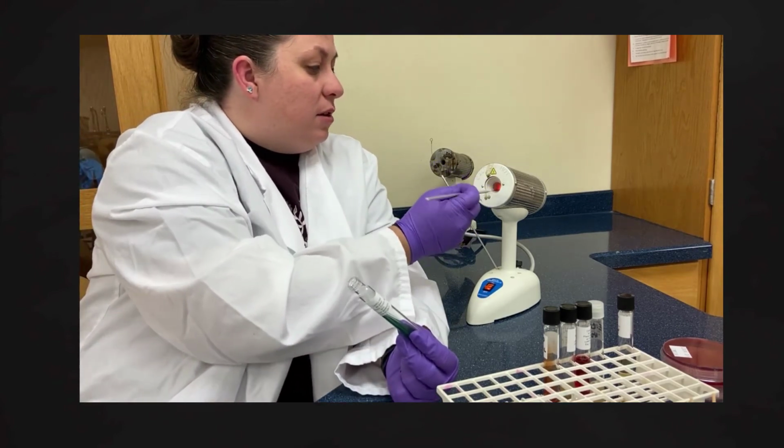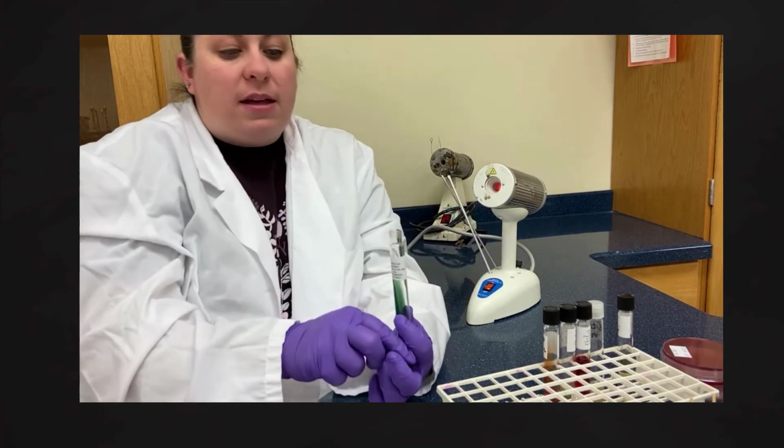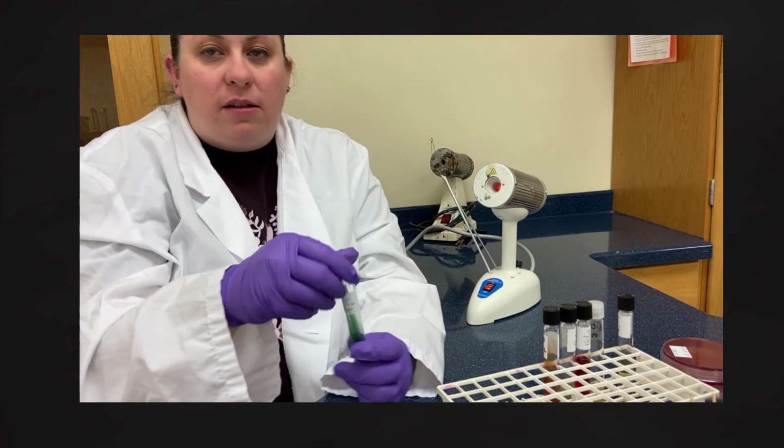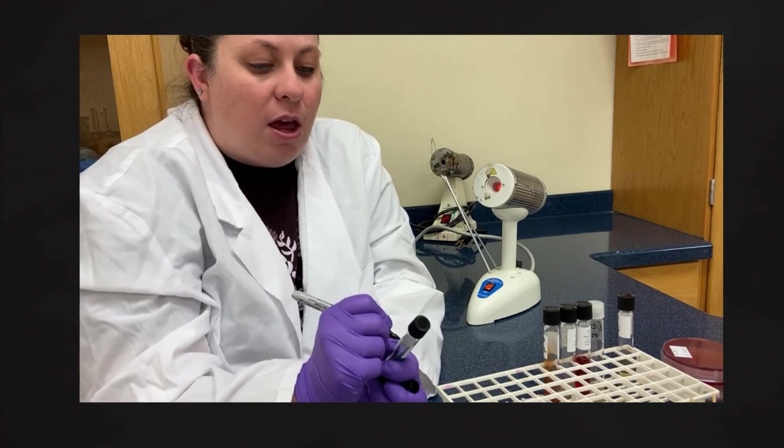Again, sterilizing the loop when we are done. Okay, so these processes, again, lid on, half turn, put our name on it.